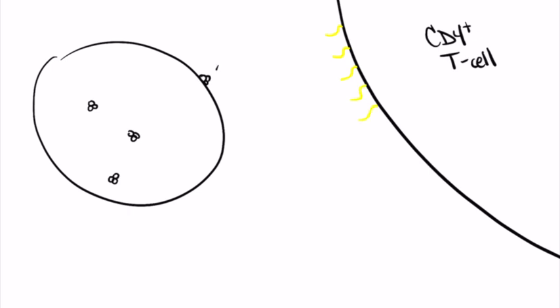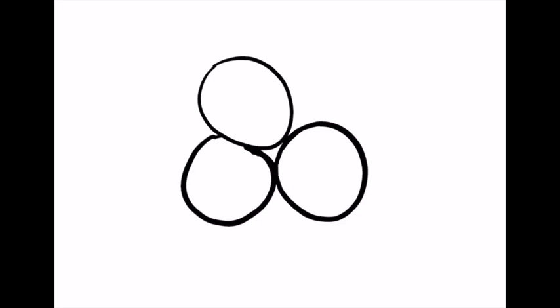Each spike trimer is capable of binding 3 copies of CD4, resulting in large conformational changes in Env. Zooming in on a single spike trimer, intermediate structures containing 1 or 2 copies of bound CD4 molecules, which must precede full CD4 saturation, had not yet been visualized in high resolution.